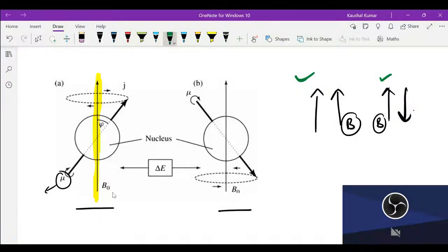In the magnetic field, there is spinning of the atom. Am I clear to you? There is a change in the spinning of the atom in turns. Either it turns from parallel to anti-parallel or anti-parallel to parallel. So there is a difference in the movements, and that will be your energy, del E.